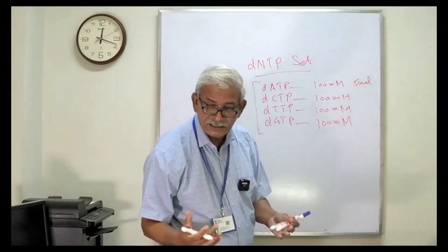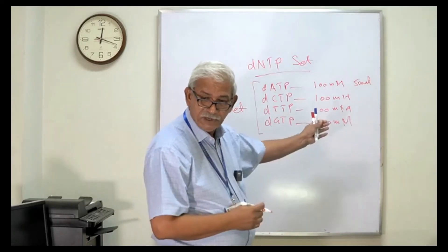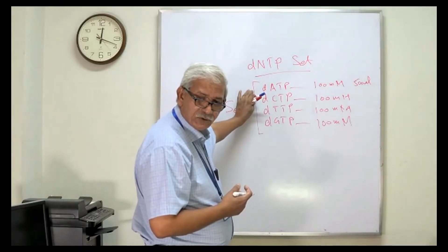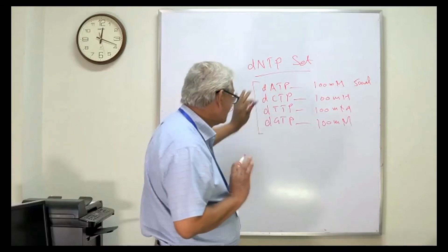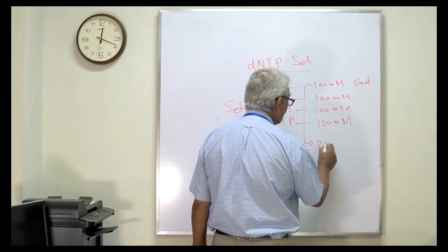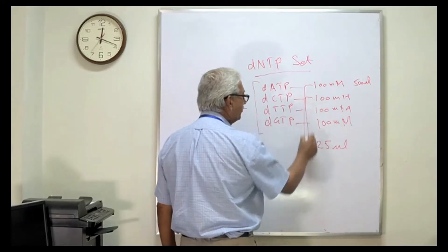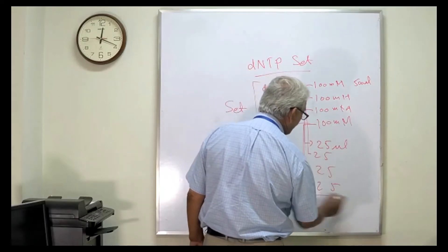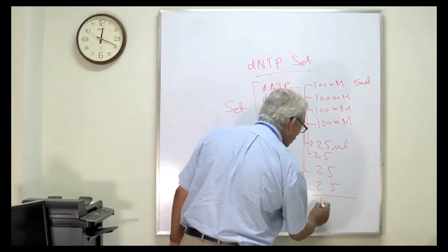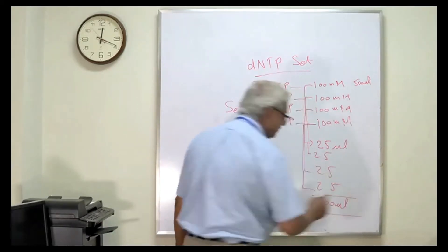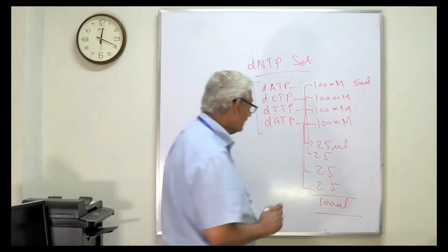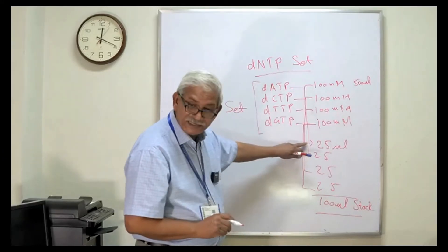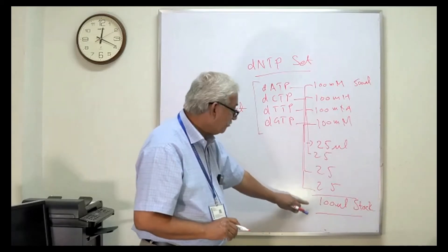What we do is we don't mix all of them together, because we will not be using 2 mL of dNTPs — we're only using 1 microliter per reaction. These are high-energy compounds and they tend to degrade over time by repeated freezing and thawing. So we take 25 microliters out of each vial — 25 from this, 25 from this, 25 from this, and 25 from this — giving a total of 100 microliters. This is what we prepare as the stock.